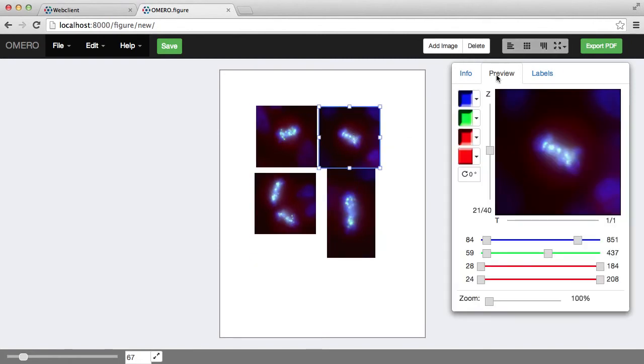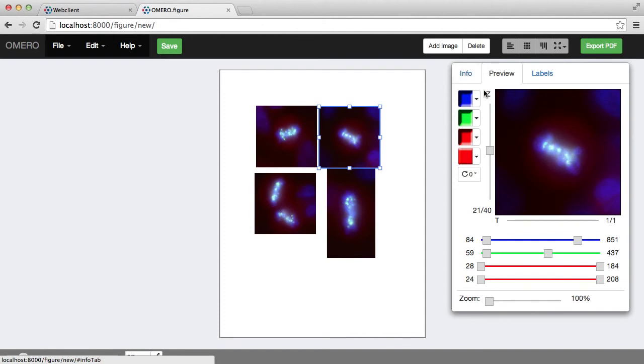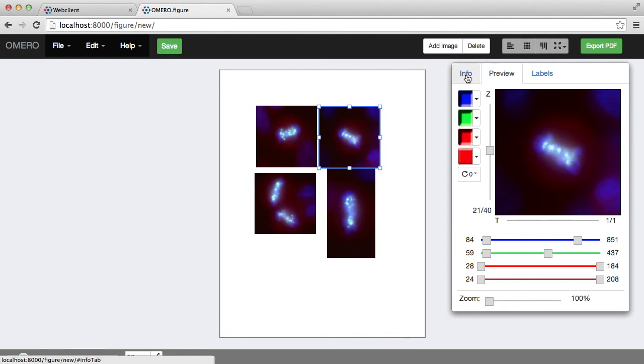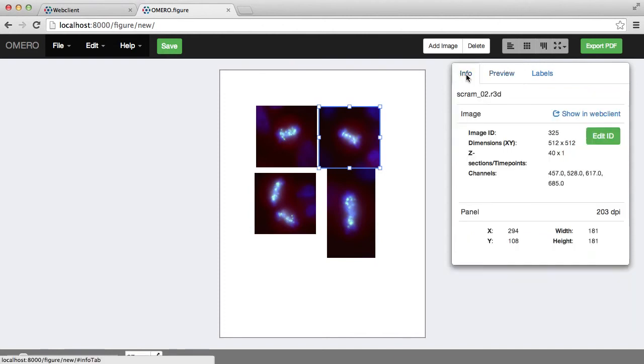Selected images are shown to the right here in these panels where I can do a lot of other edits. There's three panels here: the preview one which allows me to edit the image panel itself. The info just has additional information about the image.